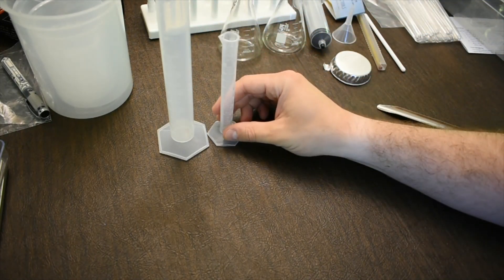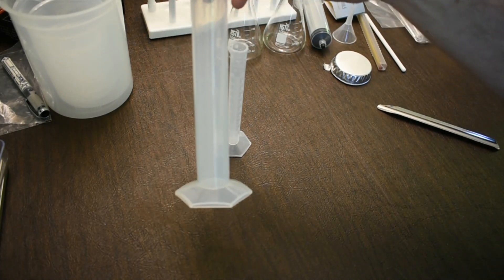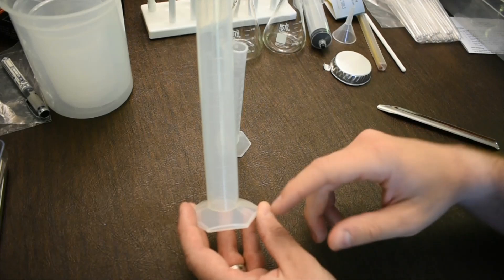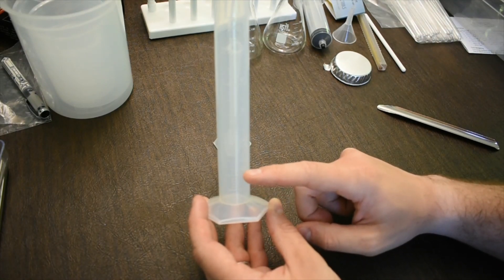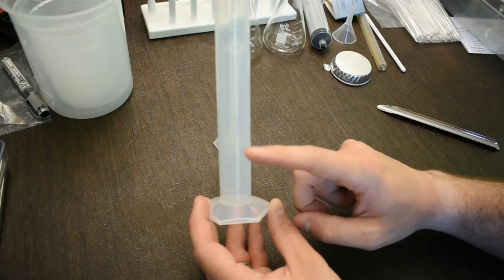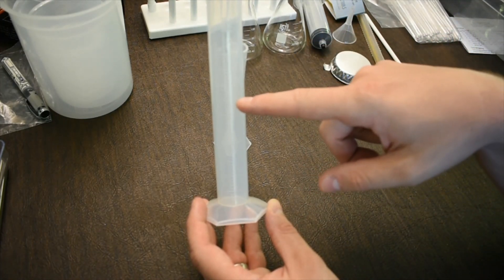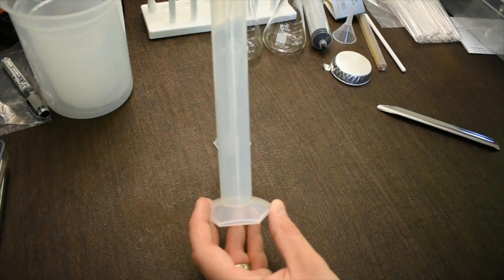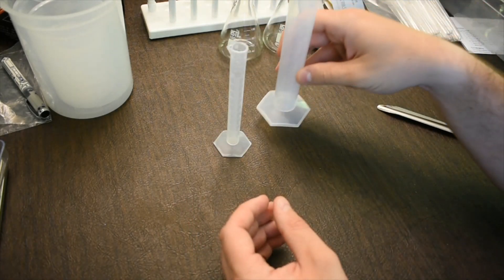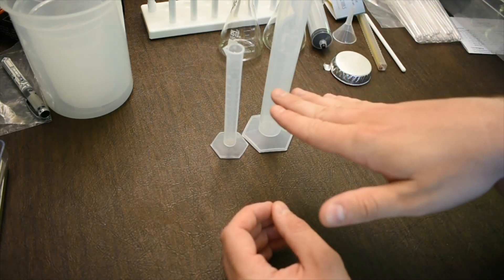The graduated cylinders have nice accurate graduations and are used to measure volume. The large graduated cylinder has a total volume of 50 mils with one-milliliter increments. The larger marks represent five and ten milliliter increments. You can estimate between marks — for example, reading 41.2 mils by looking at the bottom of the meniscus. Keep the cylinder at eye level to prevent parallax.